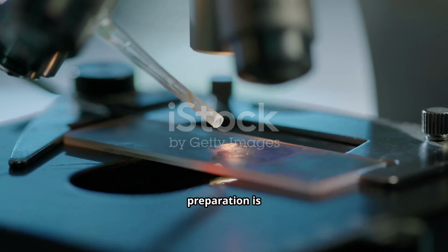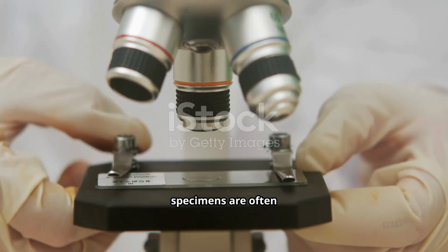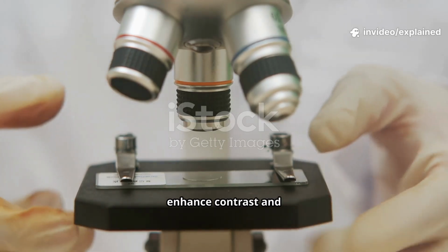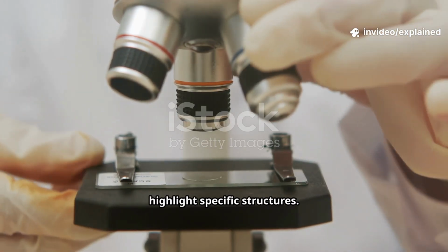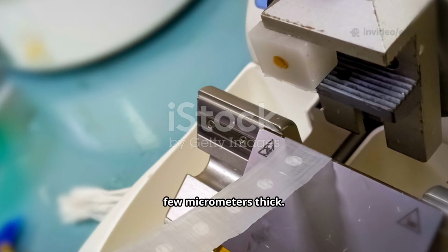Proper sample preparation is crucial for quality microscopy results. For light microscopy, specimens are often stained with dyes to enhance contrast and highlight specific structures. Samples must be thin enough for light to pass through, typically just a few micrometers thick.